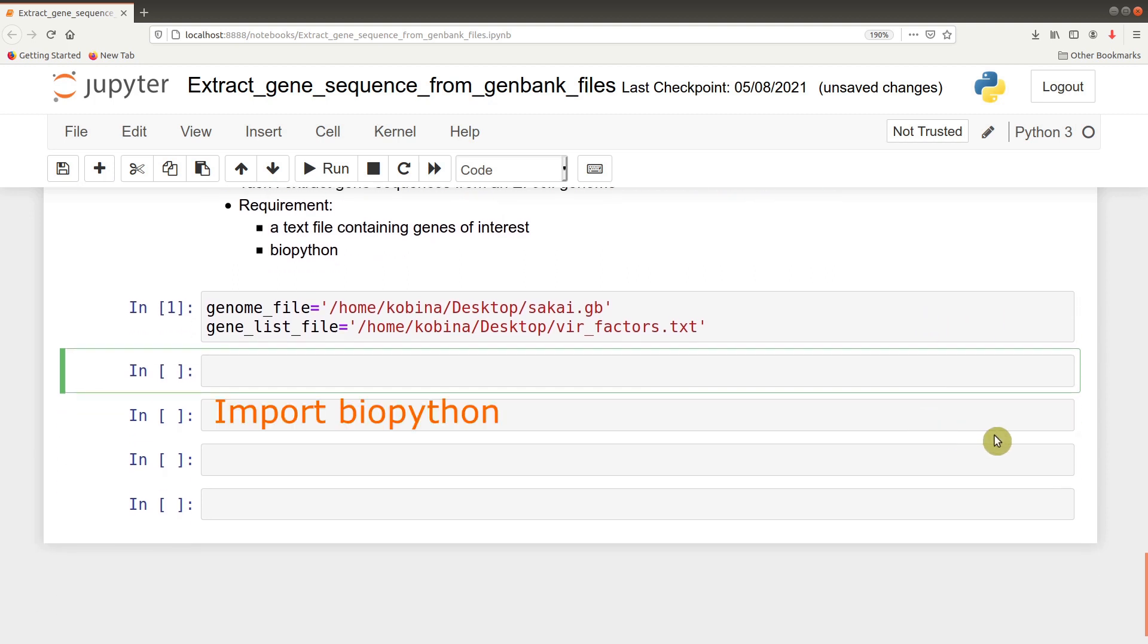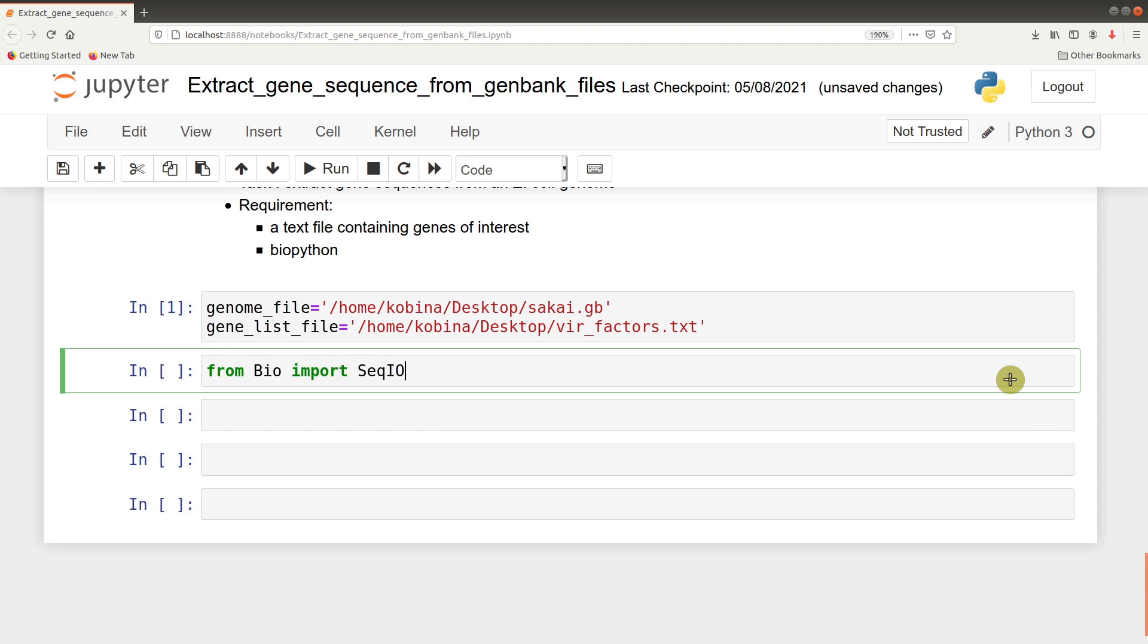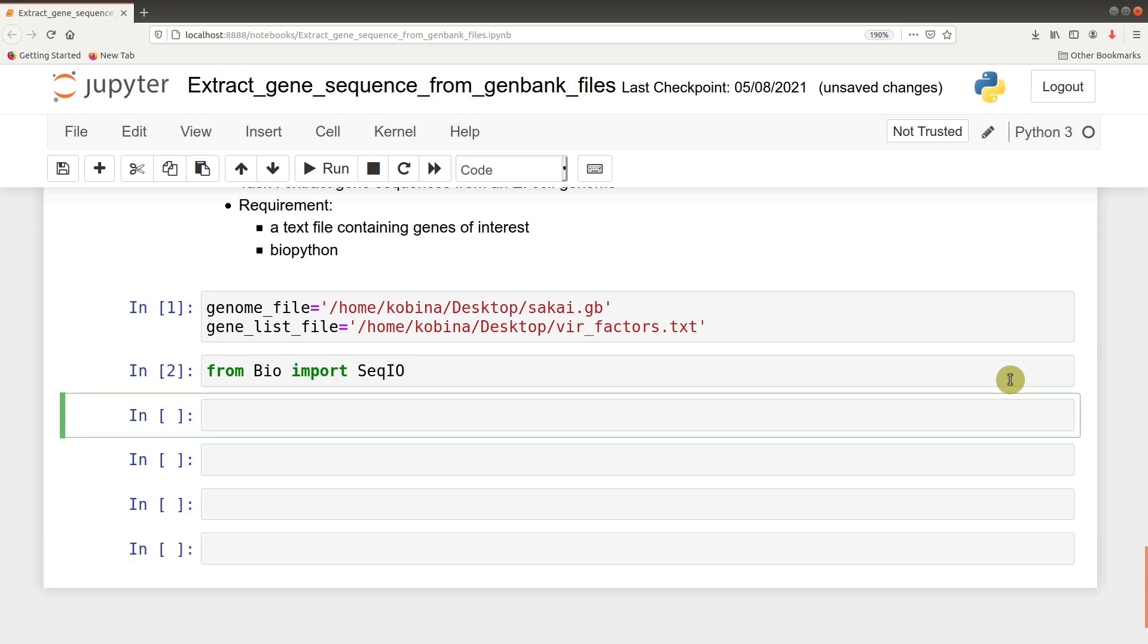After setting the path, we will now import our BioPython library. So we say from Bio import SeqIO. That is also done.